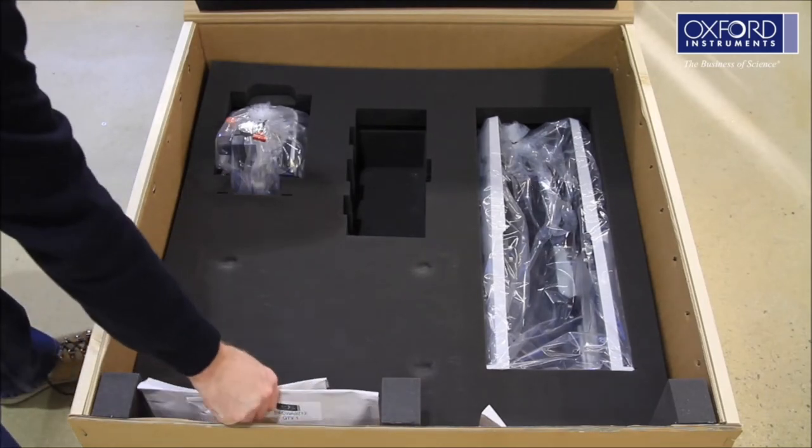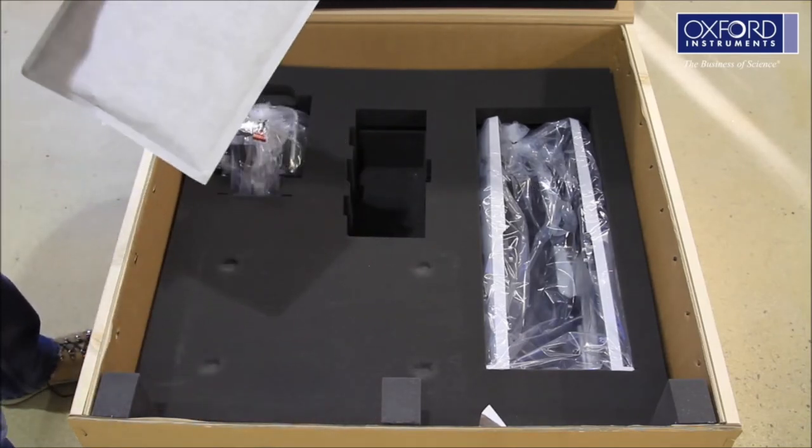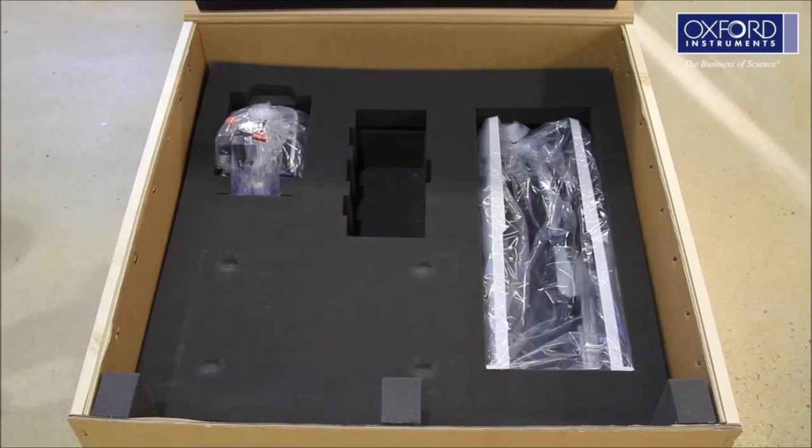Remove the packages containing all the system cables and put them somewhere safe. Remove the next layer of foam.